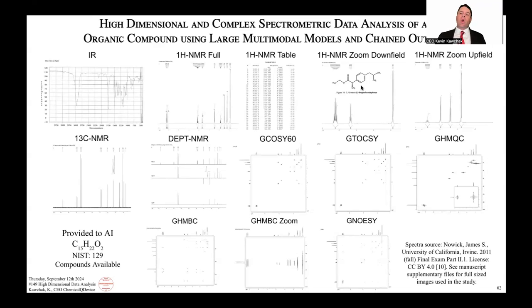Basically where all this is going is that there's two ways of looking at this. You can either fully trust the LMMs or the LLMs to do this processing of high dimensional data for you. You can sometimes ask them how they actually came across it, or you could probably even specify. So say, using PCA or using PLS, perform this high dimensionality reduction problem using all these spectra, and that's something it may do. But the moral of the story is it's a huge thing, because high dimensions, across drug synthesis and medicine and all these types of things, is a massive issue.